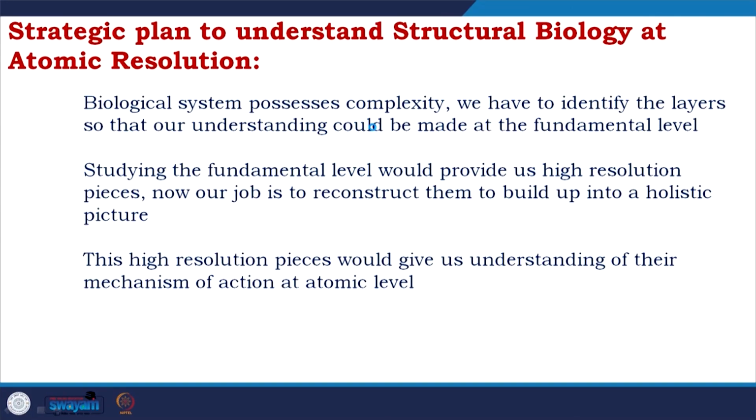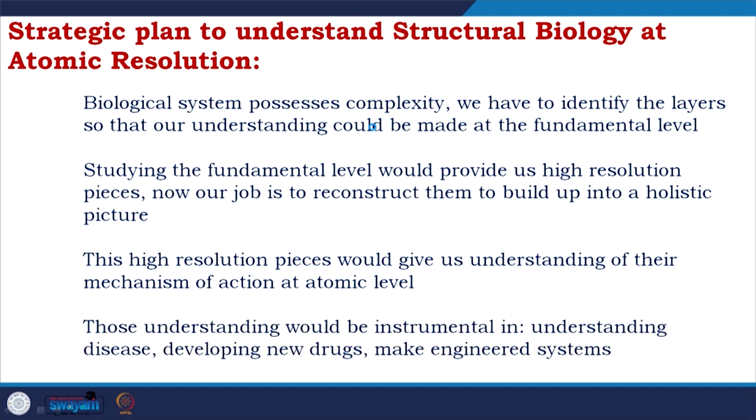These high resolution pieces would give us understanding of their mechanism of action at atomic level.